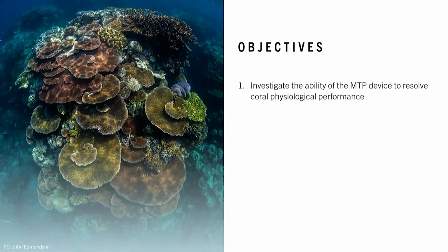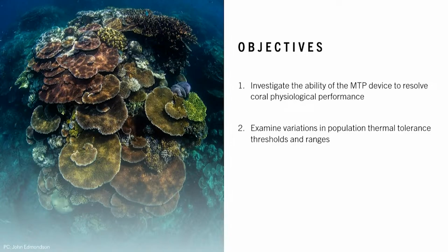So that brings me to the three objectives of this work. Firstly was to investigate the ability of the MTP device to resolve coral physiological performance across a diversity of sites. Secondly was to examine variations in population thermotolerance thresholds and ranges as a means to potentially identify more tolerant populations or individuals.